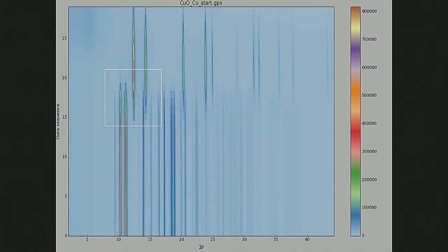Up at the higher temperature regions of your plot, it looks like you're actually losing some of the copper. Is that real? Do you know what's happening to the copper up in those upper temperatures? So what we ended up finding, and I think that this was simply user error and maybe a factor of heating or cooling too quickly, but we ended up seeing the conversion of the copper metal to an amorphous copper compound. So that's why you kind of see this shady region up here. But ideally, it should have just gone to copper metal.